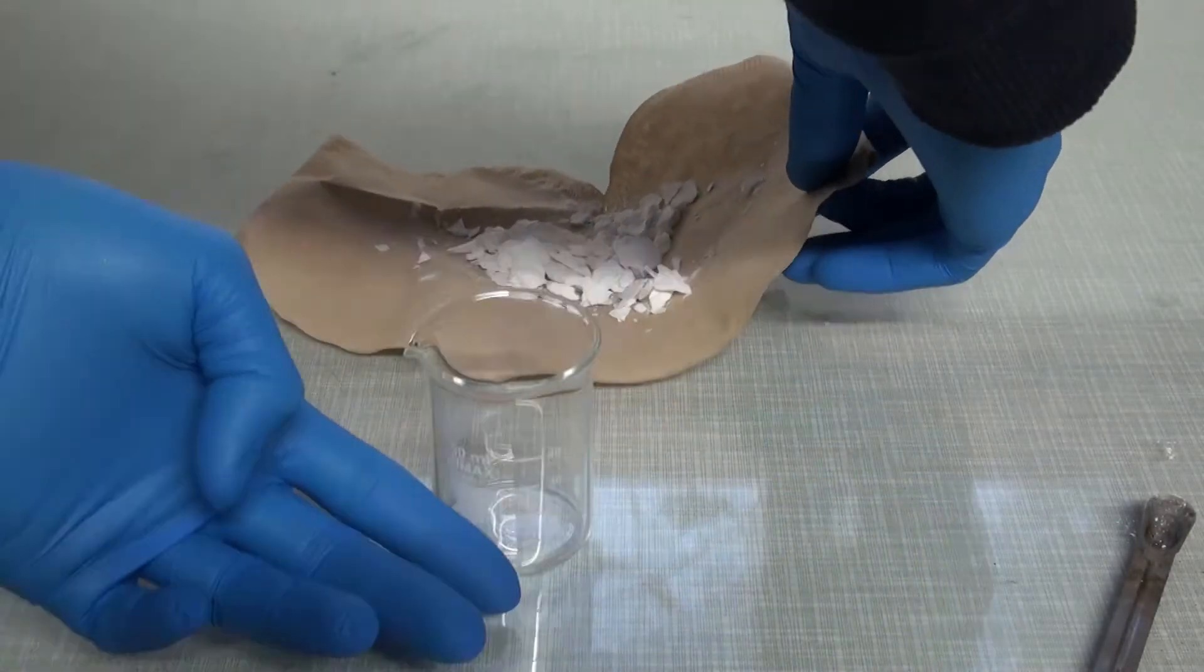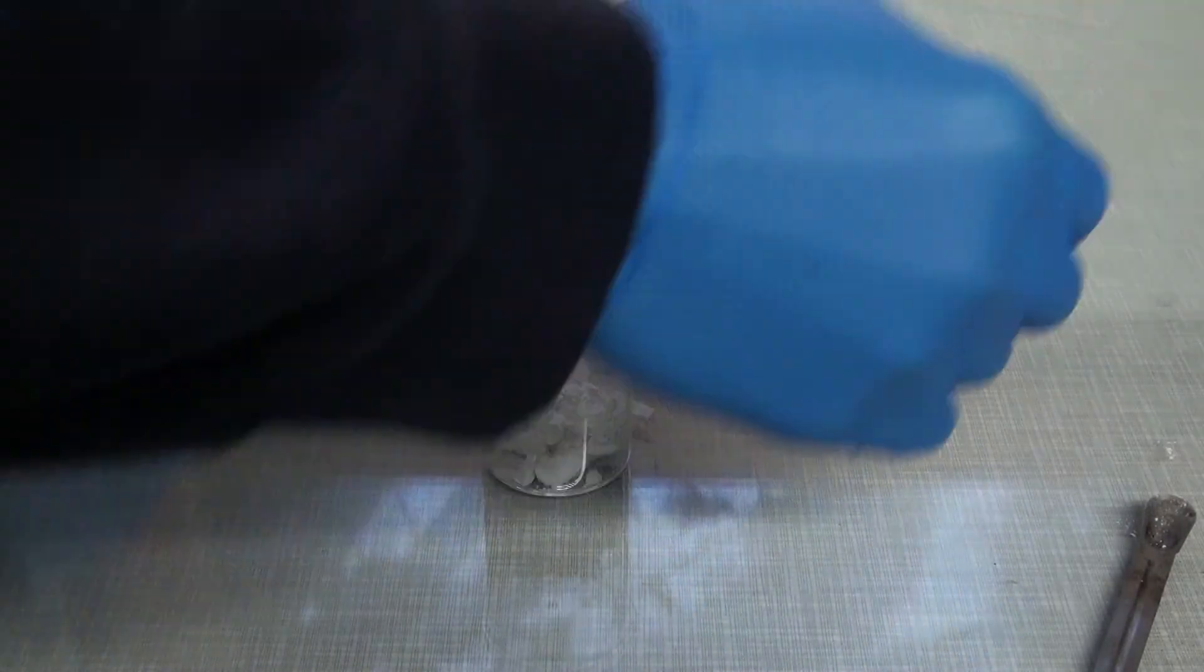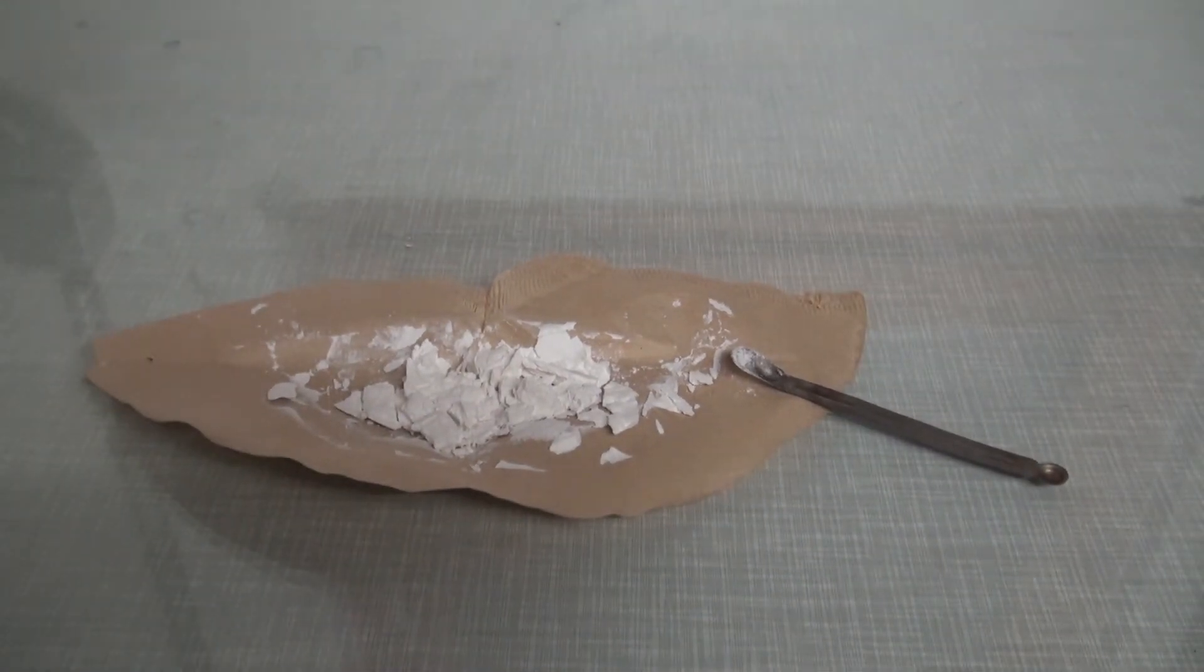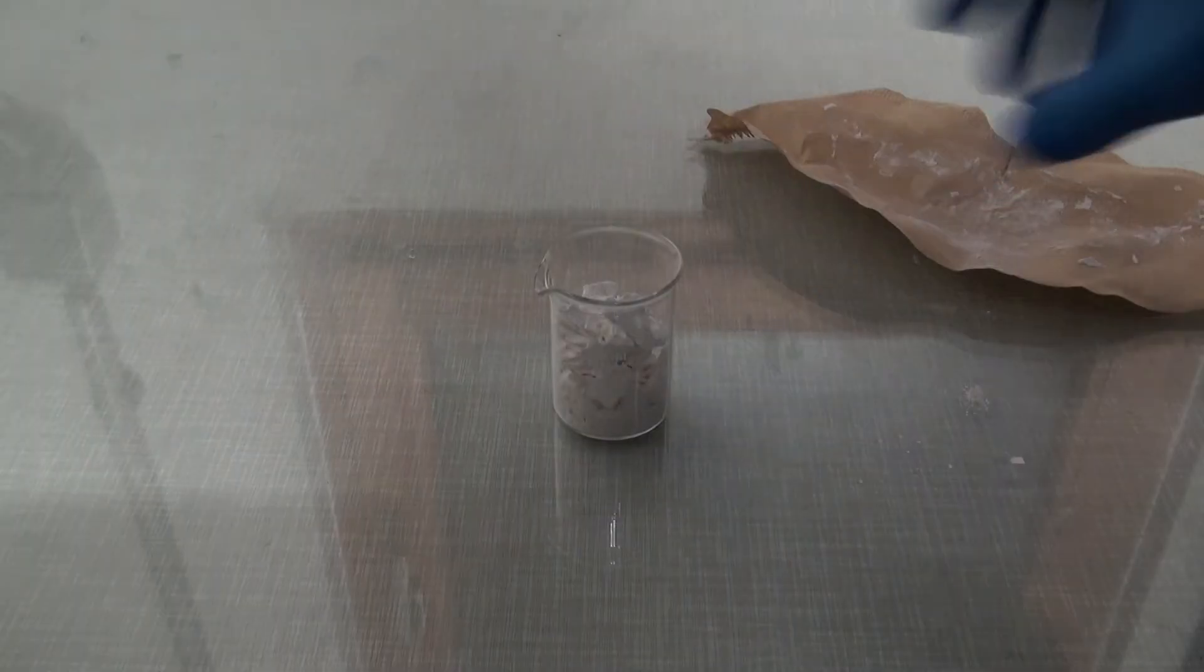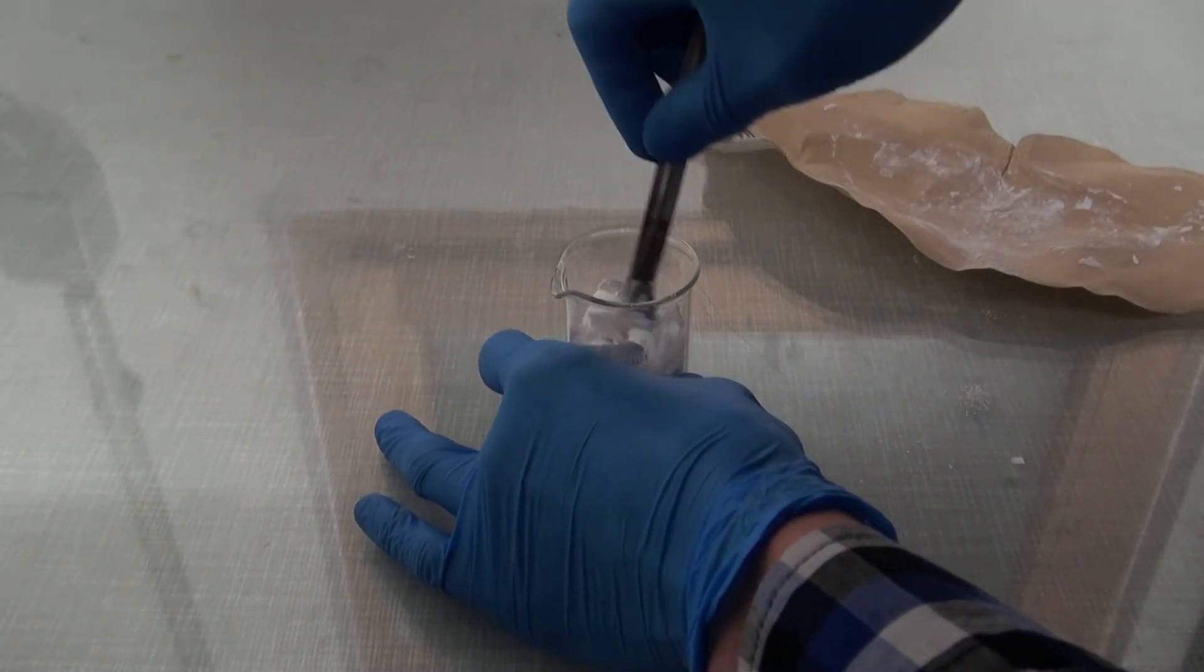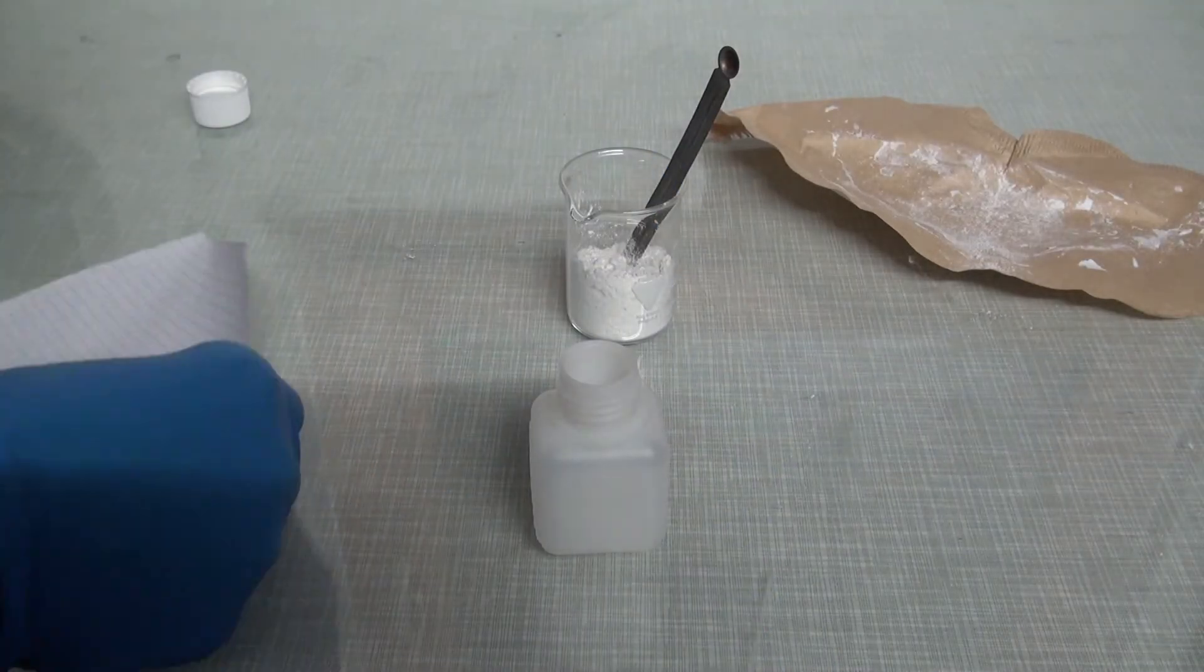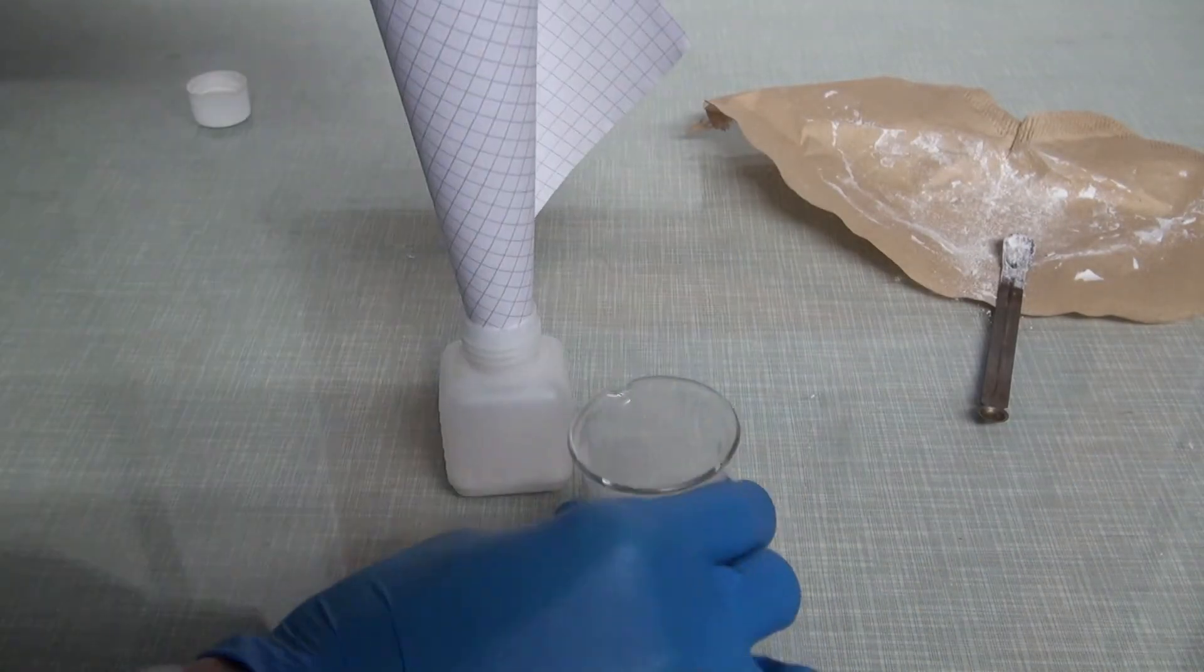The precipitate was filtered and dried. The oxidation was repeated one more time with a similar result and the product was combined with the result of the first one. It was transferred into a storage container and labeled.